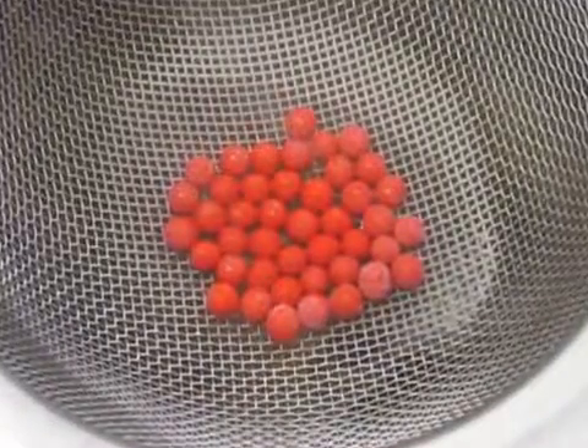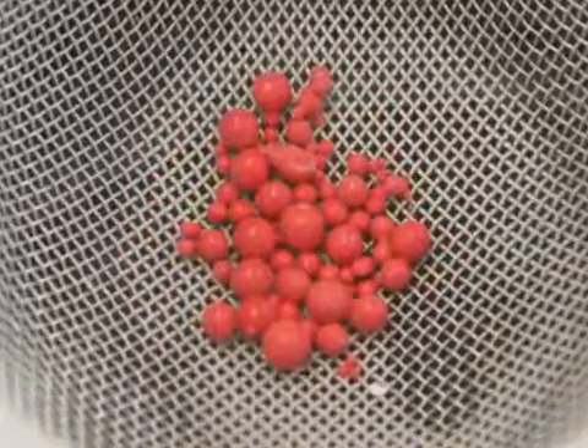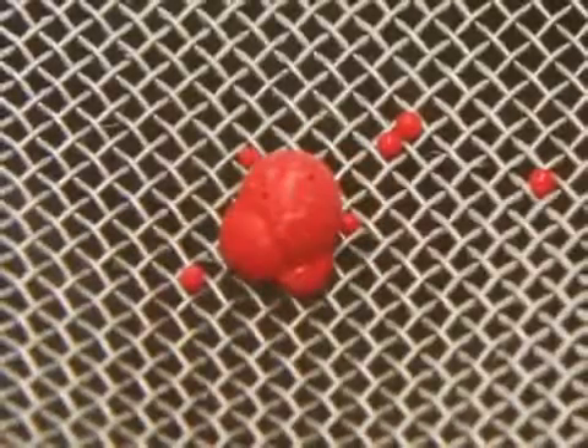These are optimal droplets — notice how they are uniform, smooth, and not clumped together. These are suboptimal droplets. They are either too small, filled with air bubbles, or clumped together.